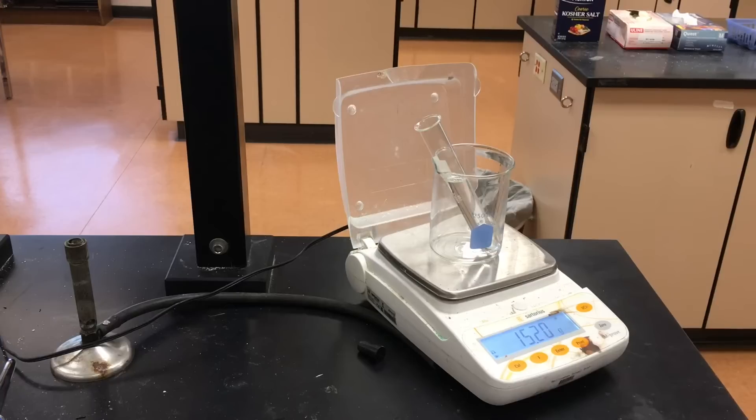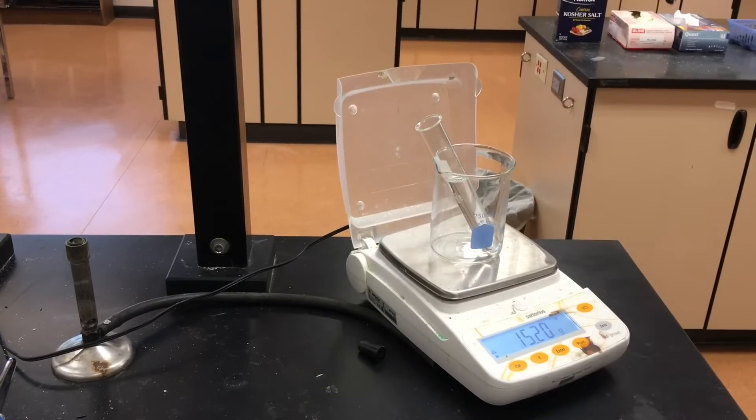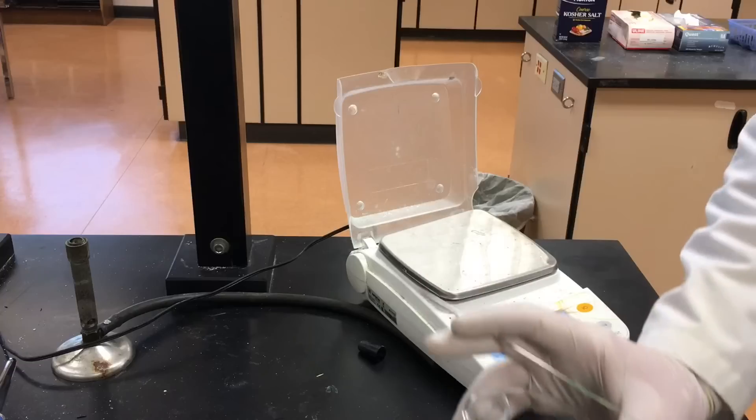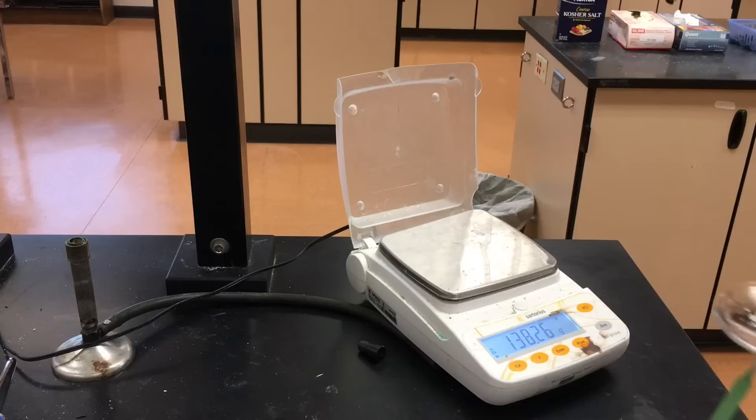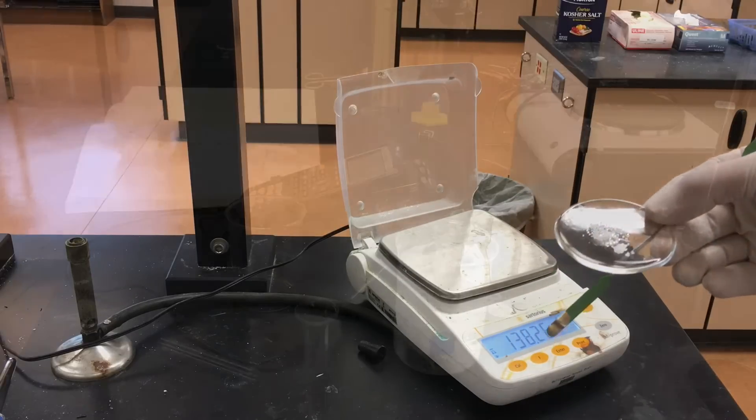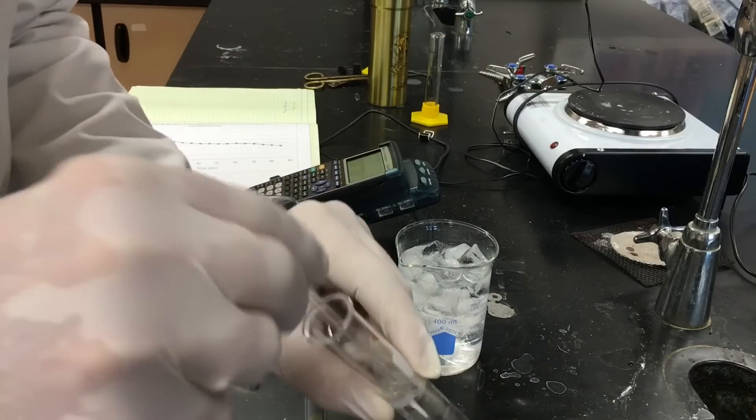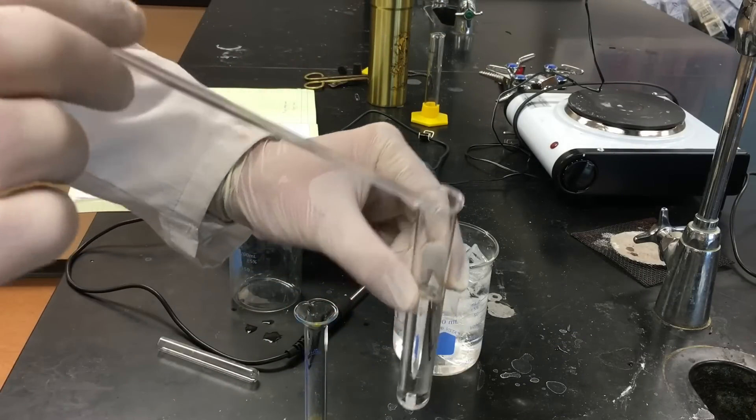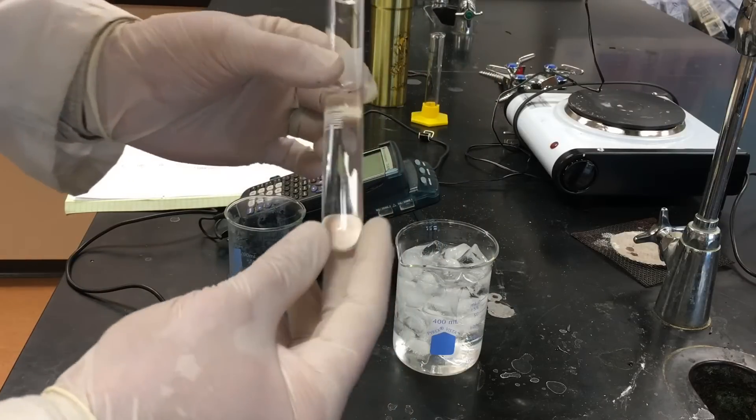Then we're gonna add our unknown to the cyclohexane and make a solution. We're gonna add the unknown carefully and make sure that it's completely dissolved. Our unknown is completely dissolved in the cyclohexane. So now we have our solution. All we have left to do is to find the freezing point of this solution.